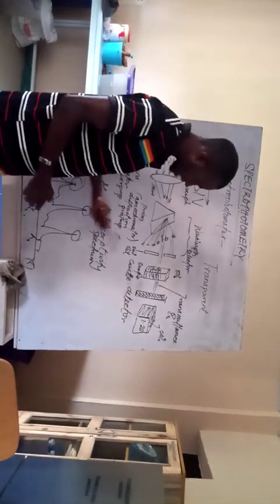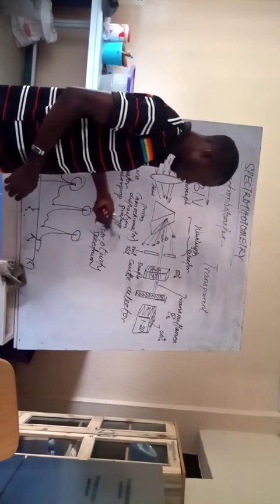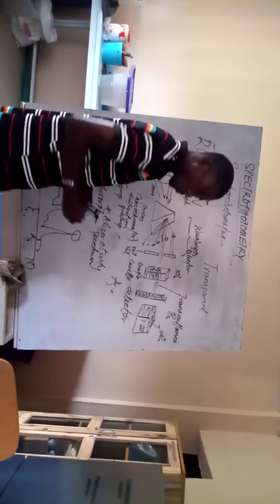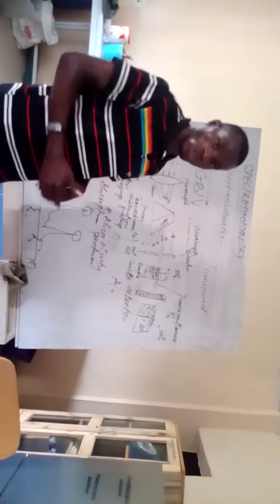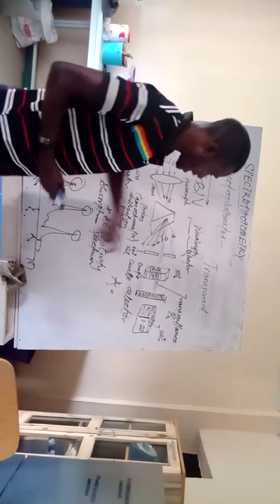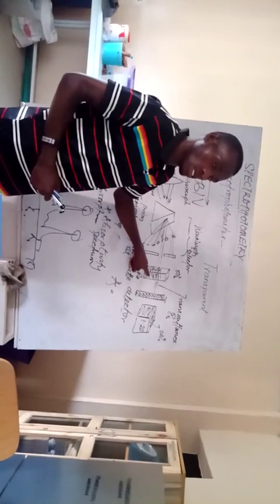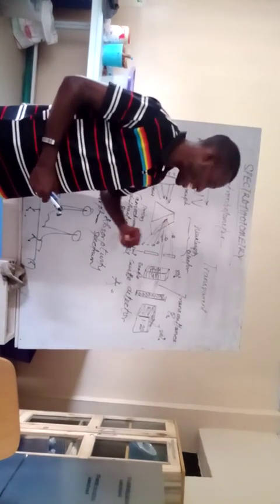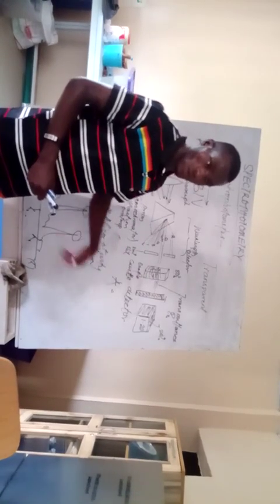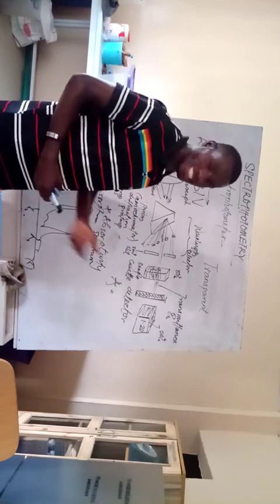All right, and this whole process that we use to get the absorbance of the material makes it useful for us to be able to calculate the concentration of that sample. You remember I said earlier that the higher the concentration of this substance in the cuvette, the higher the absorbance, because the higher the concentration, the more light is absorbed, and the less the transmittance.